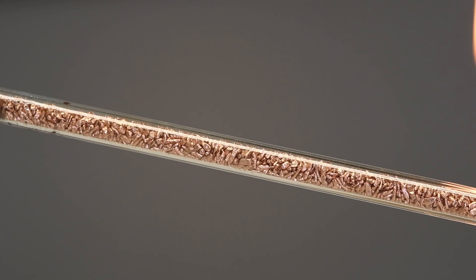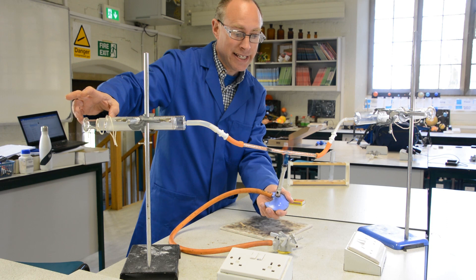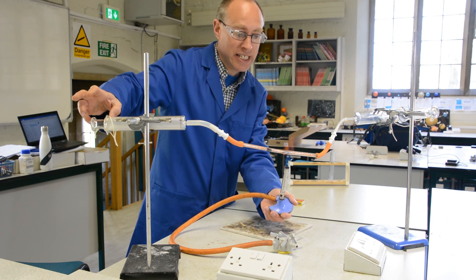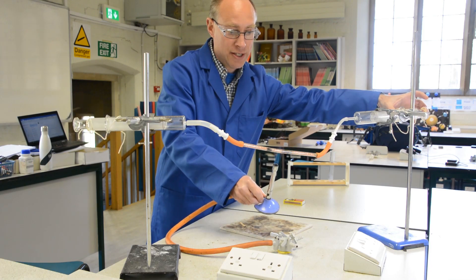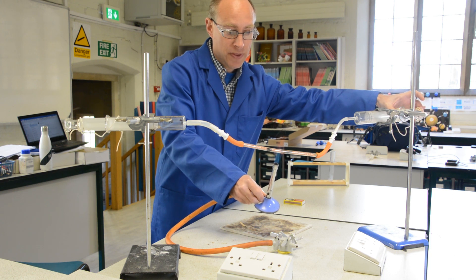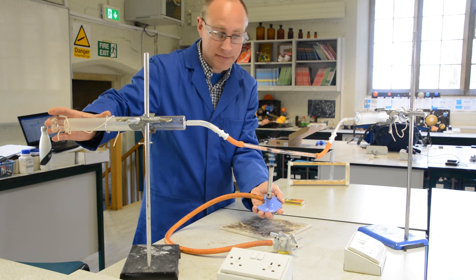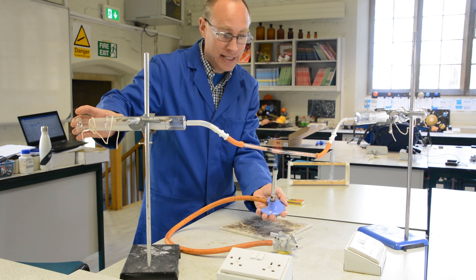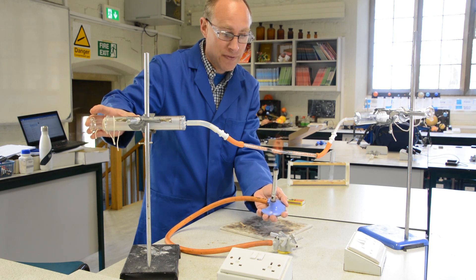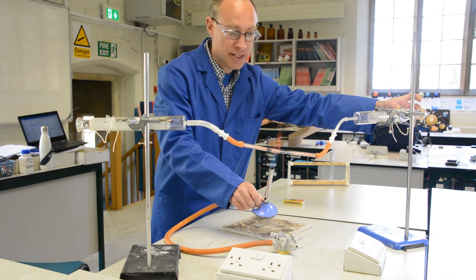Copper oxide has a black colour. So you can see that the copper in the tube where I've been heating it has gone black from the normal orange colour of copper. And so what that will do is remove the oxygen from the air, producing copper oxide, until eventually all of the oxygen has been removed.